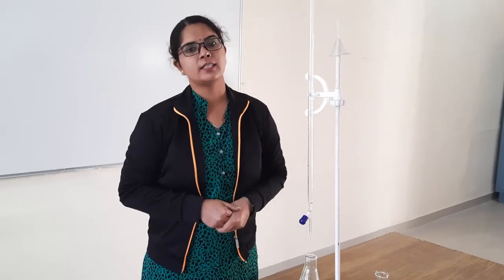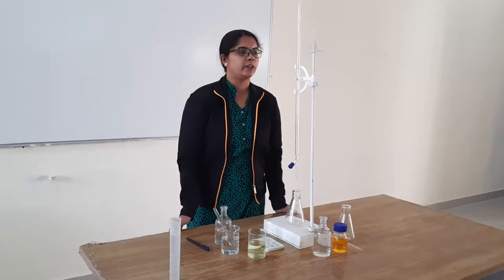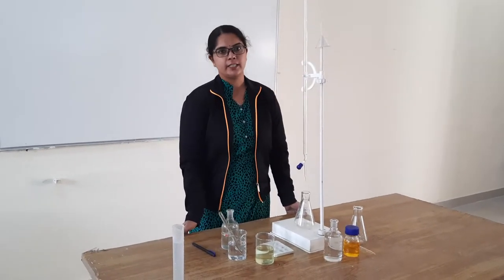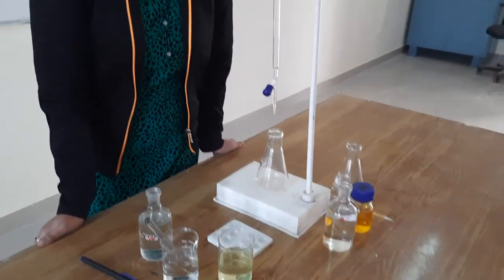Hello everyone, this is Dr. Anuja Singh and today we are going to perform an electrochemistry lab. Our today's experiment is the titration using external indicator. We are using ferrous ammonium sulfate and we are titrating it against potassium dichromate solution using the external indicator potassium ferricyanide.